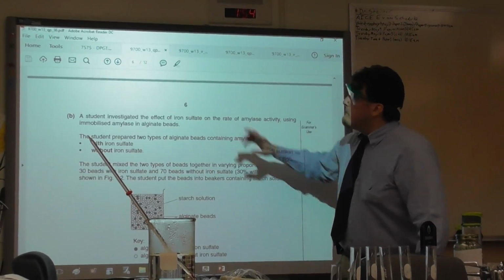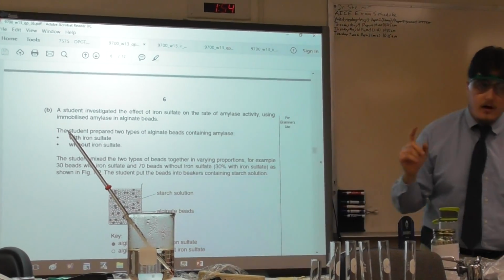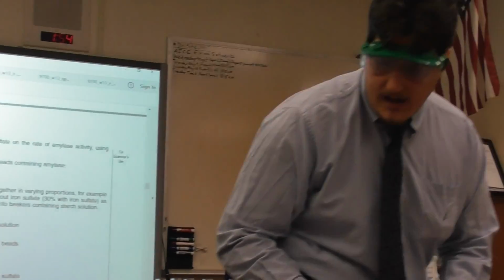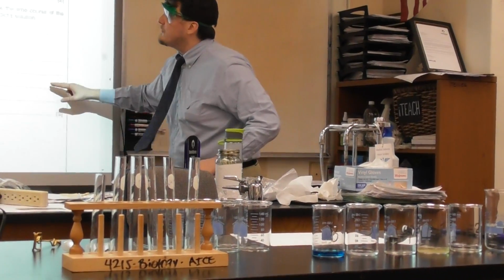Now, part B we can discuss in another video. Right now, I'm going to take some time to do this reaction. All right? I'm going to come over here and we're going to have this time. Now, I'm going to scroll back and walk through my steps. Going back to step 1.